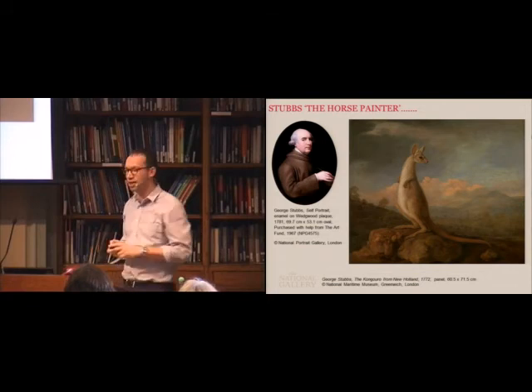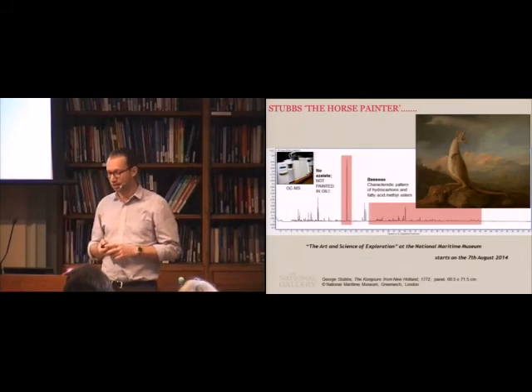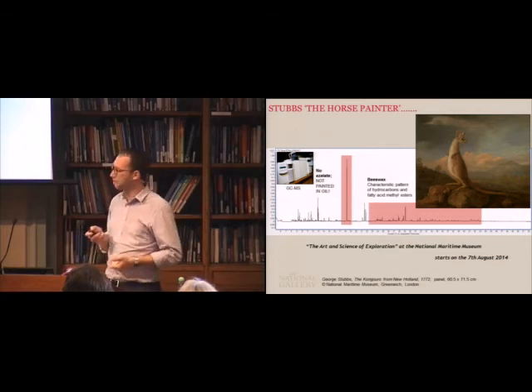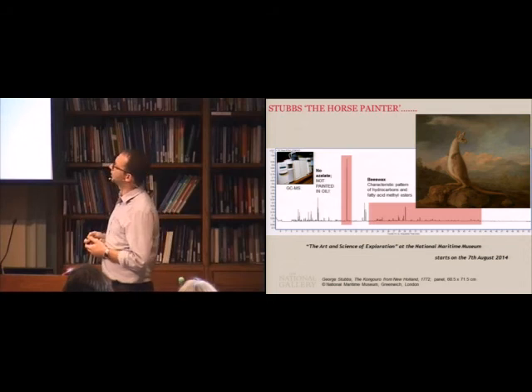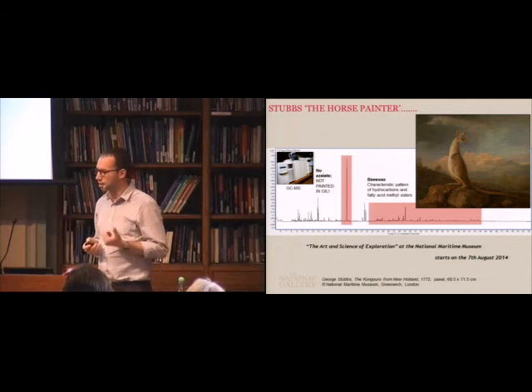And he painted it in a binder of wax. Not oil, not egg, wax. I know that because of this GCMS trace. That itself is very interesting. How do you paint with wax? But also, why? What on earth was he doing?